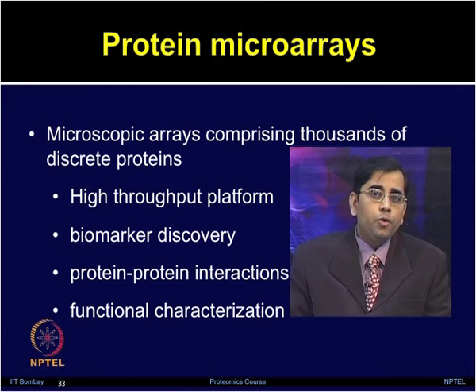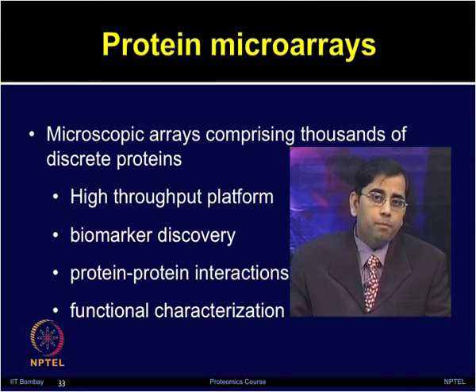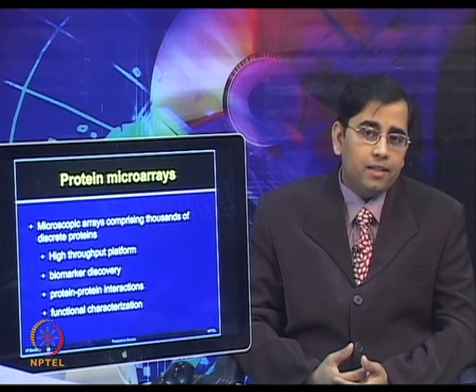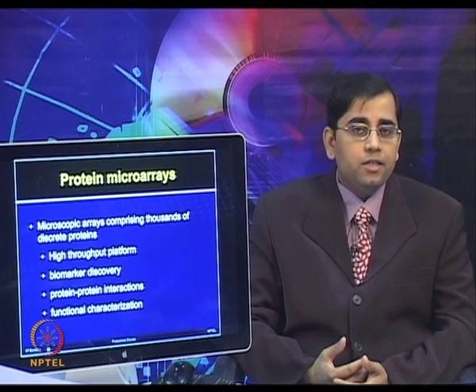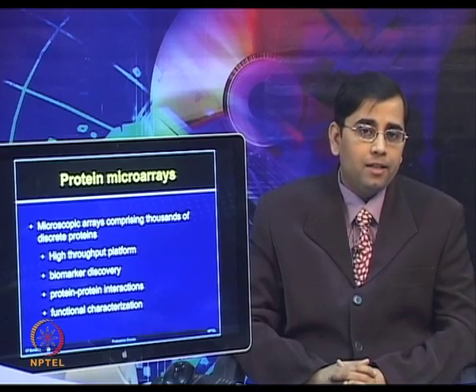The concept of protein microarrays has stirred a great deal of excitement in the proteomics community, because it can be applied for several applications such as high throughput platforms, biomarker discovery, protein-protein interactions, functional characterization of different proteins, identification of different substrates, drug inhibitor studies, etc. Once the protein microarray technology is fully realized, it promises to enable the study of a broad variety of protein features at an unprecedented pace and scale.